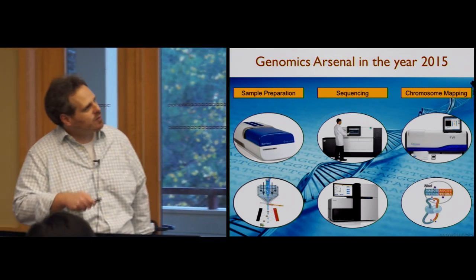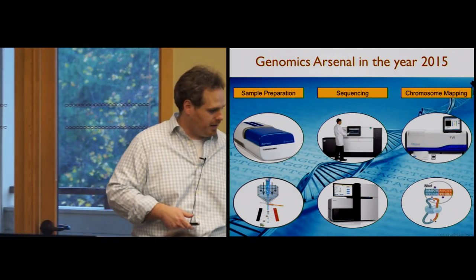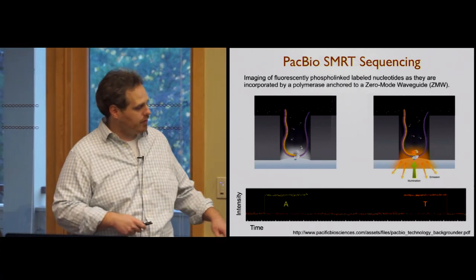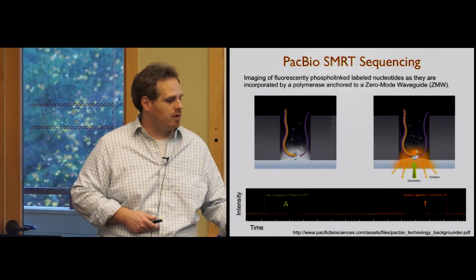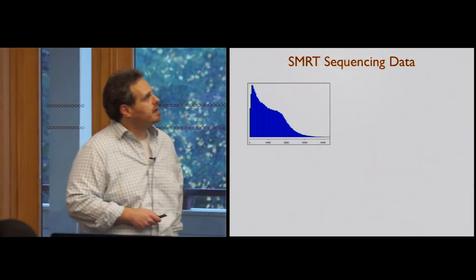What's missing here is we also have really powerful algorithms now that can make sense of a lot of these types of data. I know you guys have done a lot with PacBio sequencing, so I'm not going to walk through it. But just to remind you, it's a long-read, single-molecule approach where we're able to collect a lot of data. So this is the histogram.